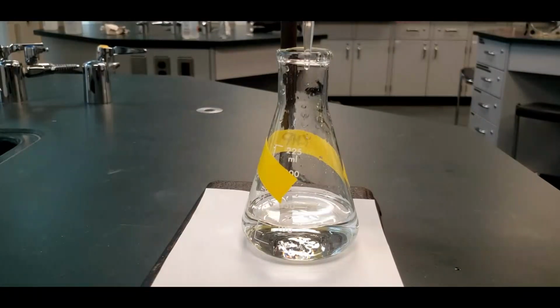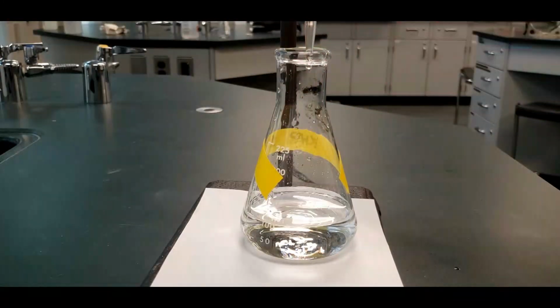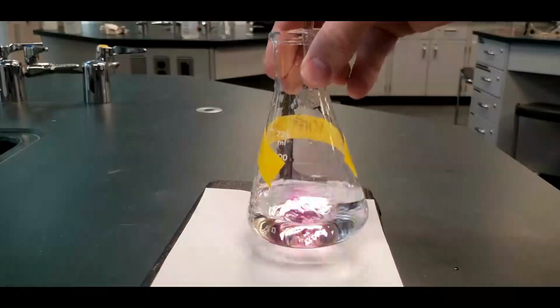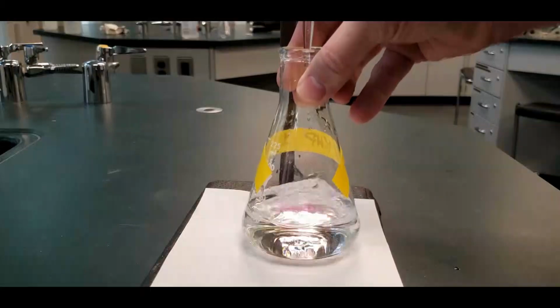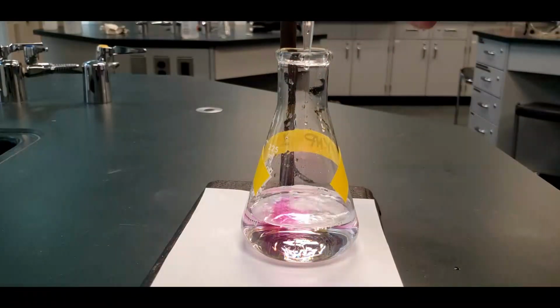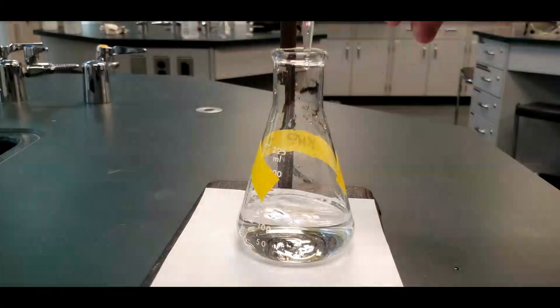So I've begun this titration of the KHP, and right now I'm at about 11 mils, so I'm just going to keep going so you don't have to watch the entire start to finish here. You know how it's going to play out now, but let's just see the end result.